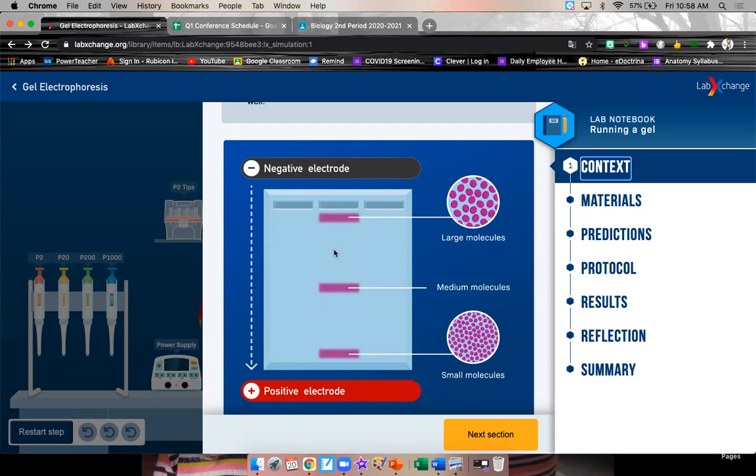And the DNA needs to move through the pores of the gel. So the smaller the molecules, the further it's going to be able to go. The easier time it's going to have moving. The larger the molecules, the harder the time it's going to have moving. So it won't go too far. So smaller goes farther, larger molecules stay up top.